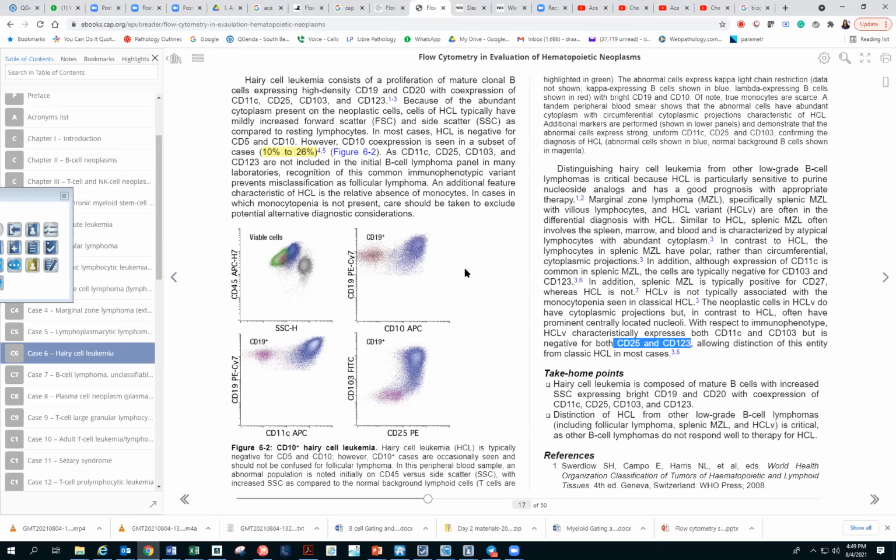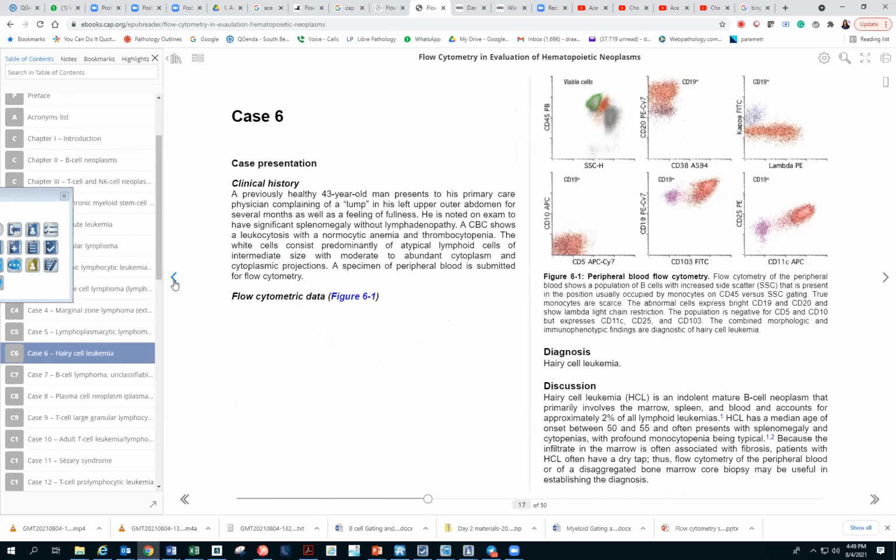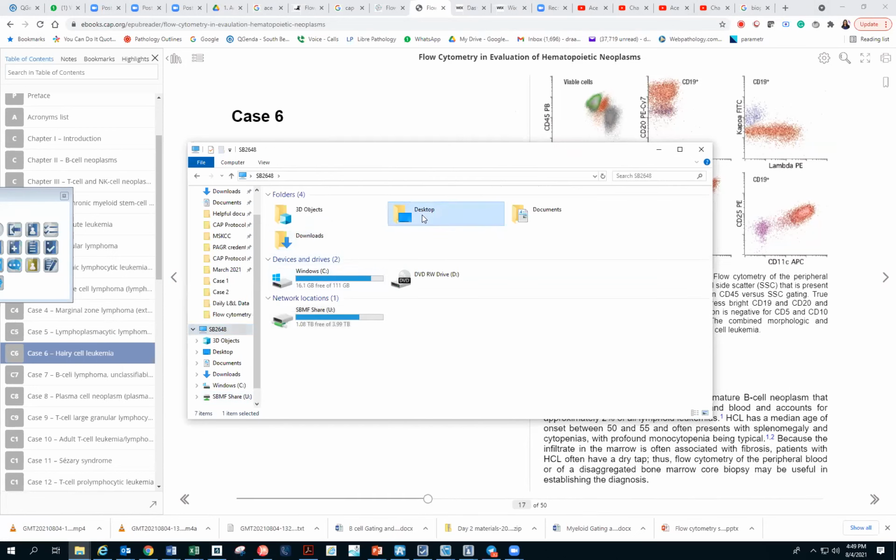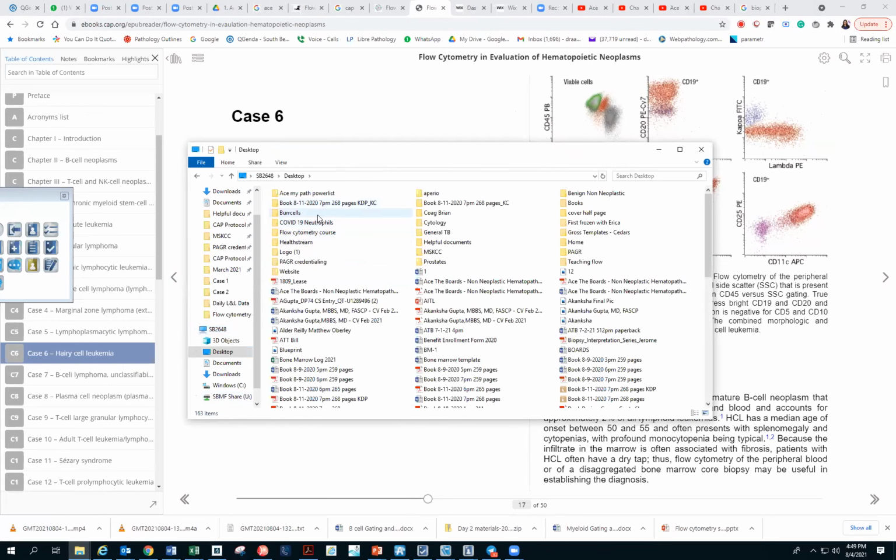I don't think we read a whole lot in this, like anything additional. Maybe what we learned was that a CD10 positive hairy cell can be present in many cases. And we used to have in our book, let me open our book, a nice differentiation chart between variant and splenic marginal zone. I think Kshitija made that chart. Let me see.